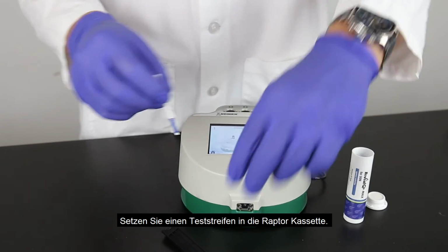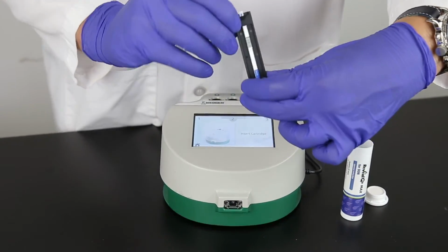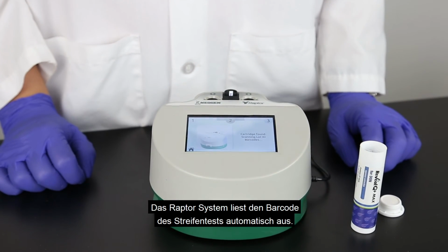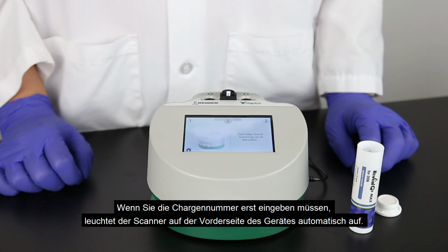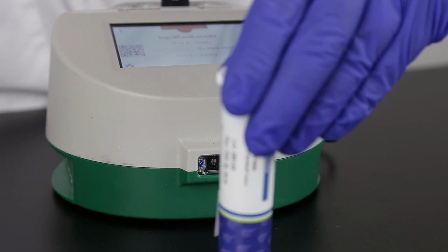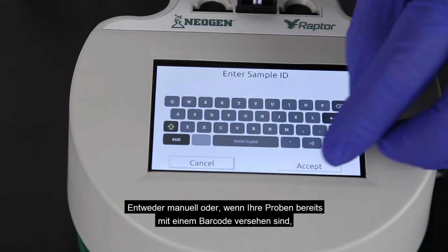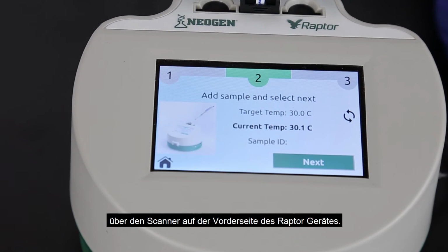Place a test strip into the Raptor cartridge. Place the cartridge in the Raptor system. You can use any of the 3 ports. The Raptor system reads the barcode on the strip. If you need to add the lot information to the system, the scanner on the front of the system will turn on automatically. Scan the QR code located on the strip tube. Enter a sample ID if you like. This can be done manually, or if you barcode your samples, by using the scanner in front of the system.